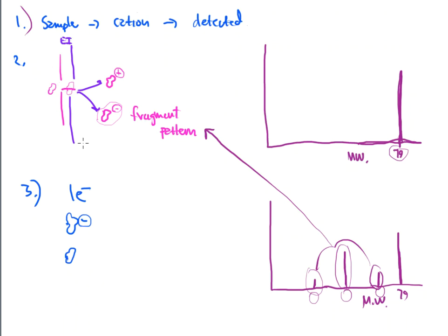It gets hit with an electron beam, but nothing happens to it. Statistics tell me that can happen. No teeth get knocked out. No fragments get shot off. The way it entered is the way it leaves. It does not carry a positive charge.